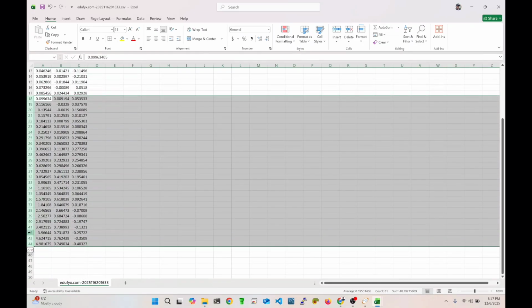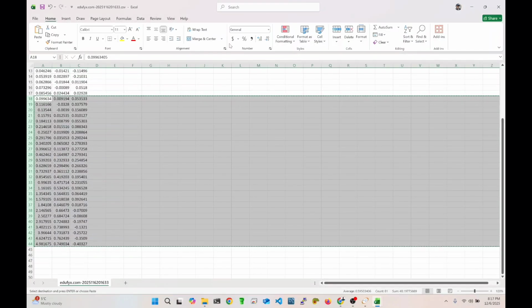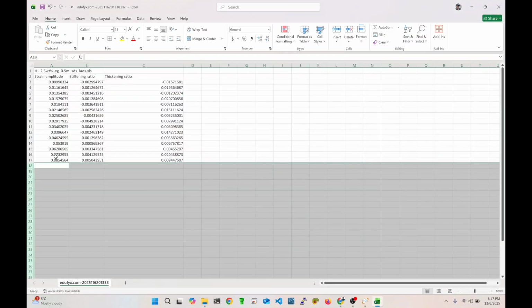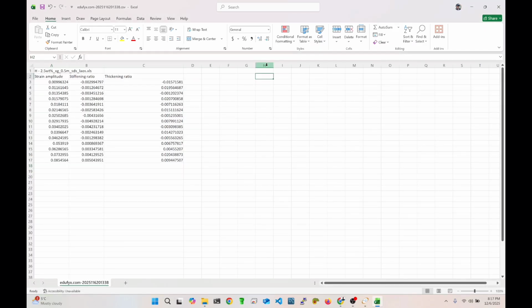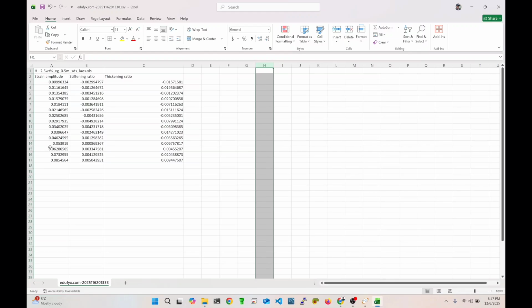So now I select this and copy it. I go back to my other data, no need to save this one, and paste it here. I probably did not copy it correctly, but you already understand what I mean.